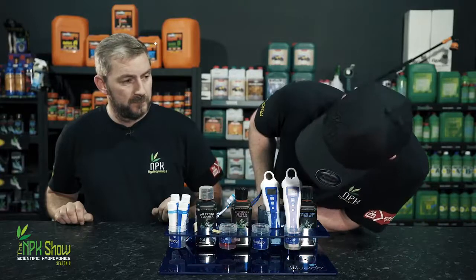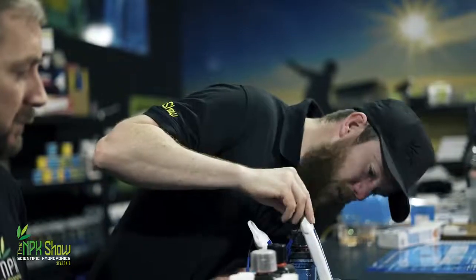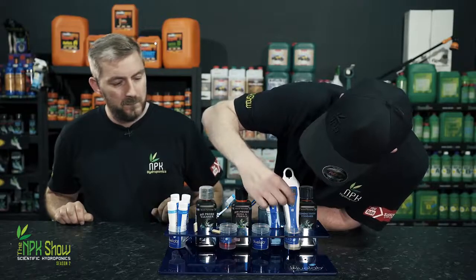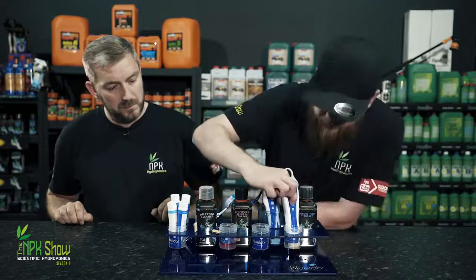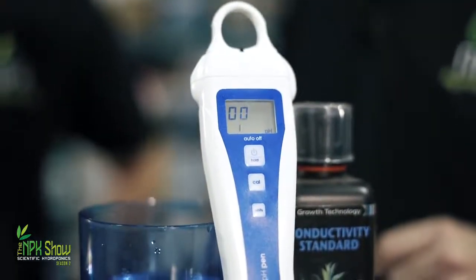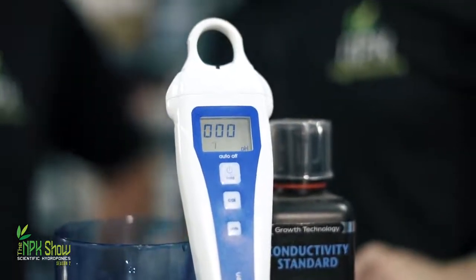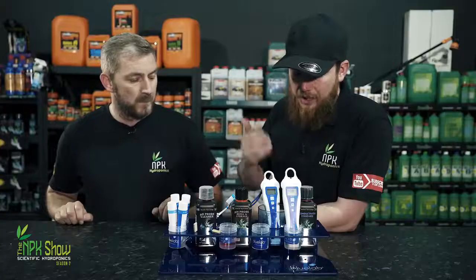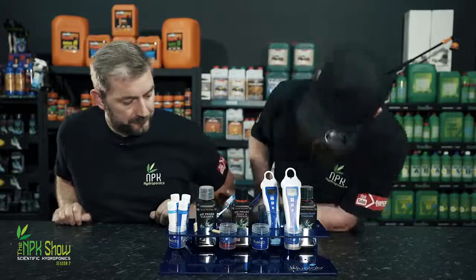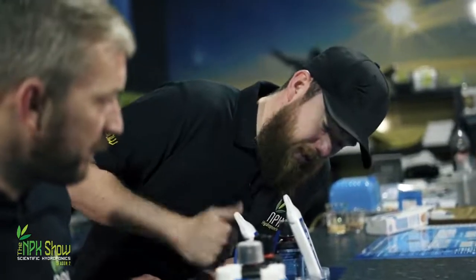So we've calibrated this pen already, and it's on 6.8. We'll probably get that to 6.9. So what we do, it's settled on 6.8. You hold the calibrate button. And these new ones now take about 15 seconds to calibrate, because with the old ones, you press calibrate and sometimes you pull it out too quick and it wouldn't calibrate properly. So now it takes about 10 seconds to fully adjust to 7. And we're nearly there. And once it's adjusted to 7, it'll say it's done.